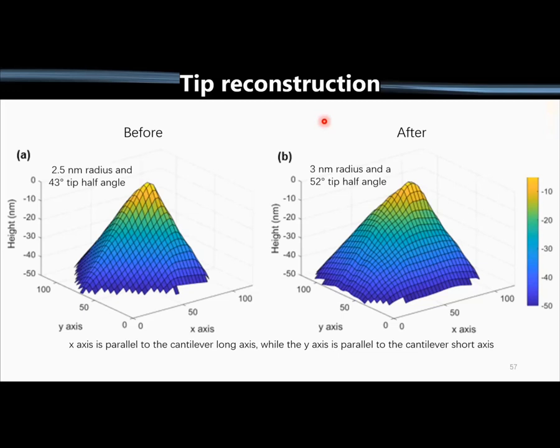Okay. Igor, as I understand, you use diamond for all your measurements. You use a diamond cantilever, yes? Diamond tip. I think not for all of the measurements, just mainly for the machining measurements. But still, for some of the PFM and electrical measurements, we tend to prefer using platinum coated, for instance.